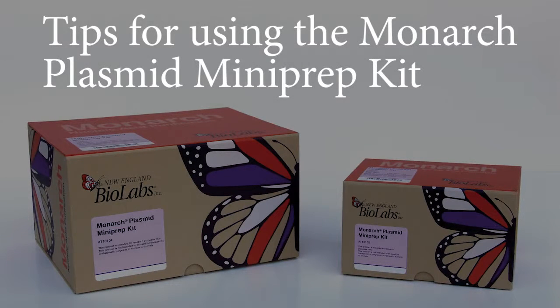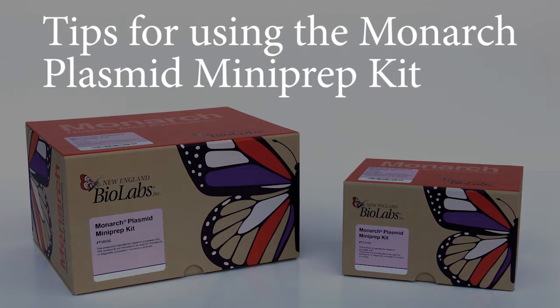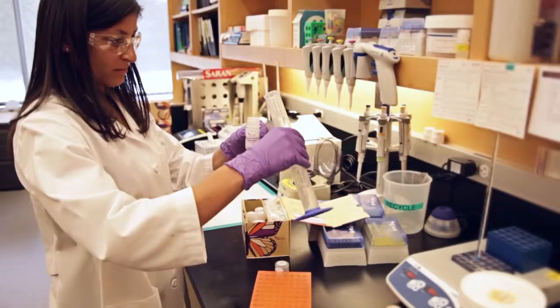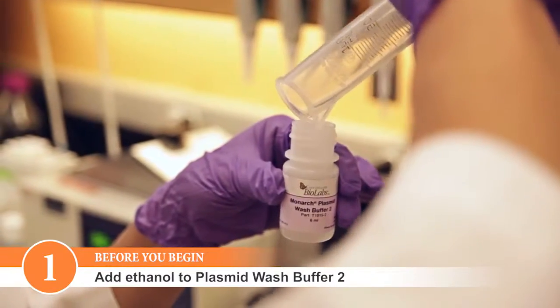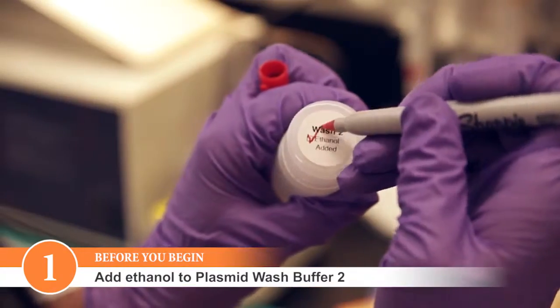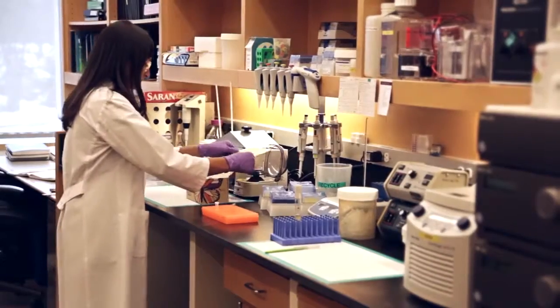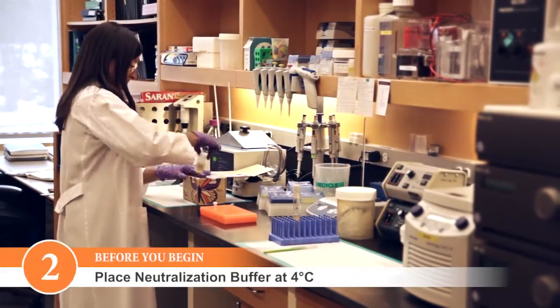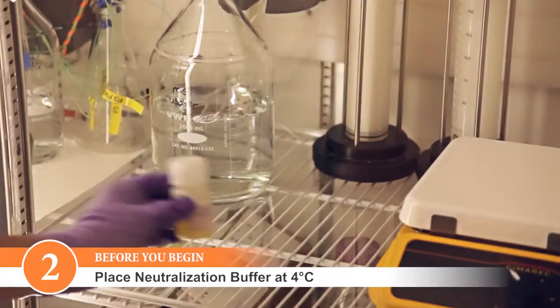Here are some tips for optimization when using the Monarch Plasmid Mini Prep Kit. We'll start with some important things to remember. The first thing you'll want to do when using your kit is to add ethanol to the Monarch Plasmid Wash Buffer 2. Follow the instructions on the bottle's label. Also, as soon as you receive your kit, please place the neutralization buffer containing RNase A at 4 degrees Celsius for long-term storage.